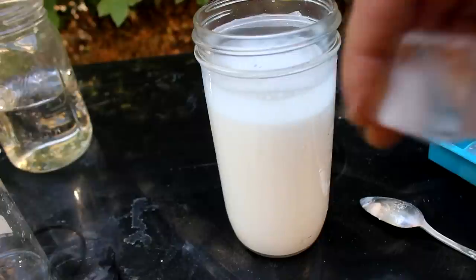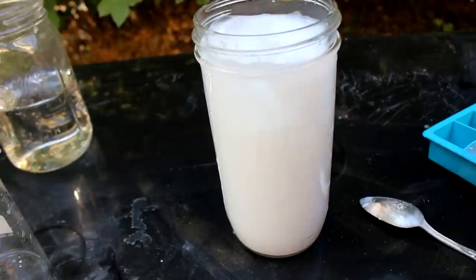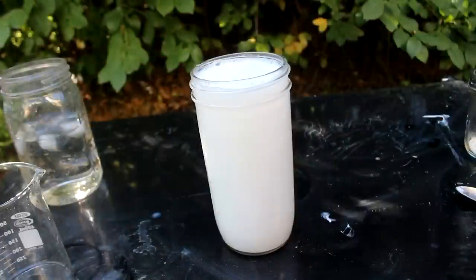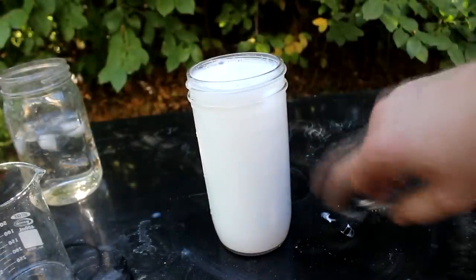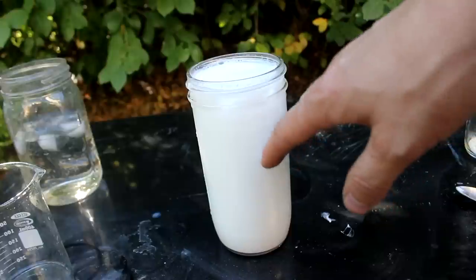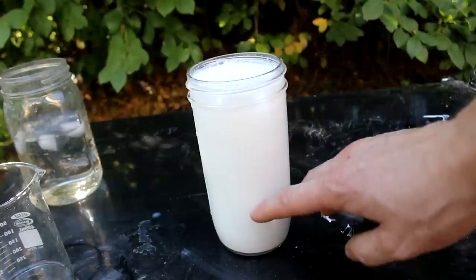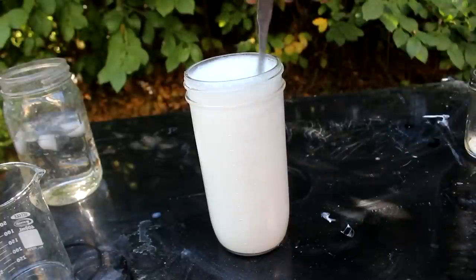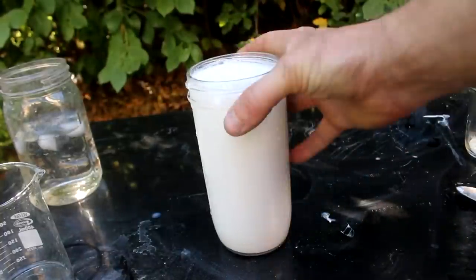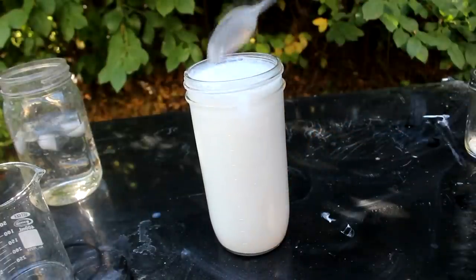Interestingly, the solubility of calcium hydroxide can actually be increased by cooling off the solution, so I'll do that by adding some ice. When I'm doing this with the actual natron brine, I'm just going to add an extreme excess of the calcium hydroxide — most of it will just settle out of solution and react as needed. As the hydroxide reacts with the sulfate, more will dissolve in, so very little will be left in the remaining solution.